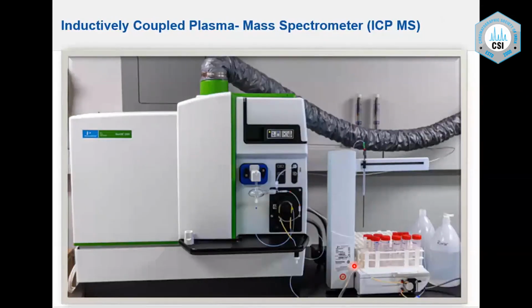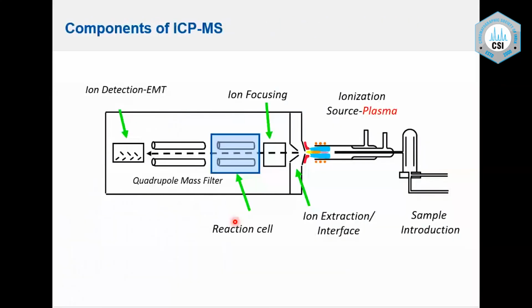It is a benchtop model, and you can operate the instrument with an autosampler, so automatic sample injection happens. You can leave it running overnight, because the argon gas used in ICP-OES and ICP-MS is not a flammable gas, and you can leave the instrument to perform automatic sample analysis.